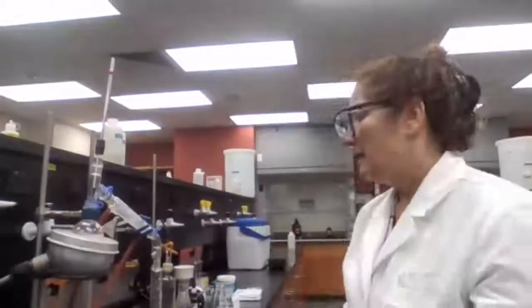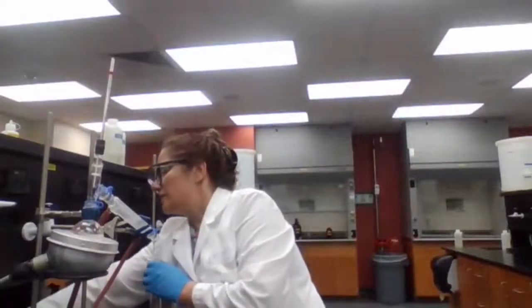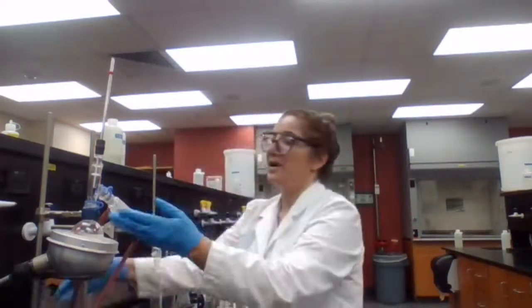Lower heat allows better distillation and no decomposition. And if it's too low, it's going to take a long time. It's not going to form enough vapor to reach the condenser.